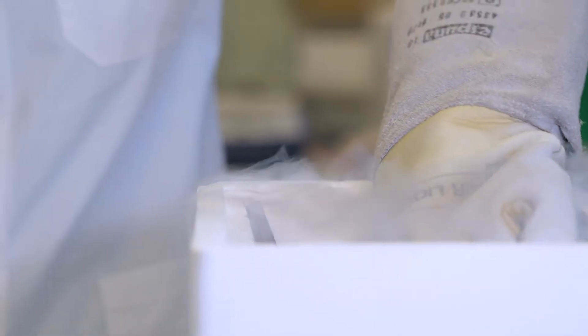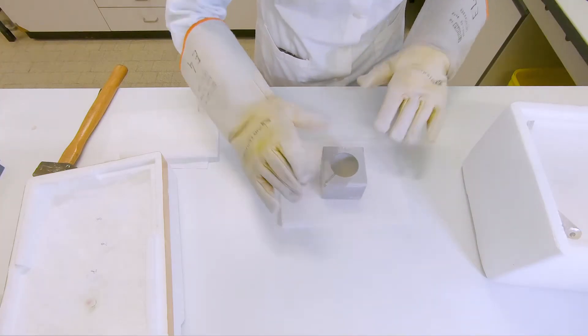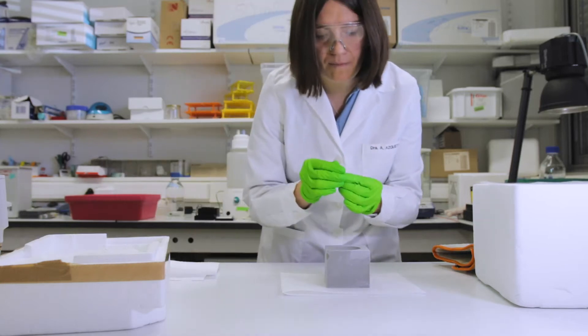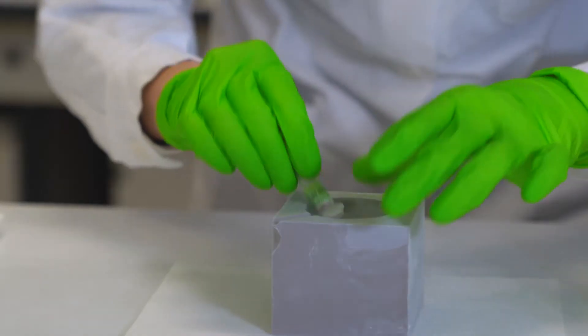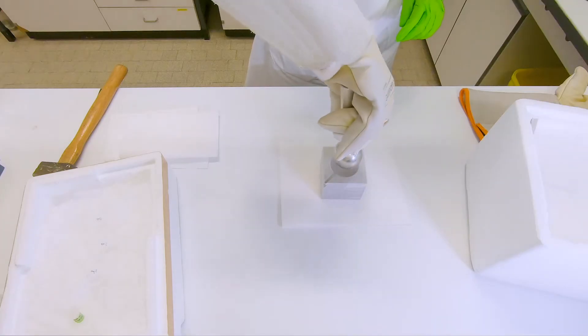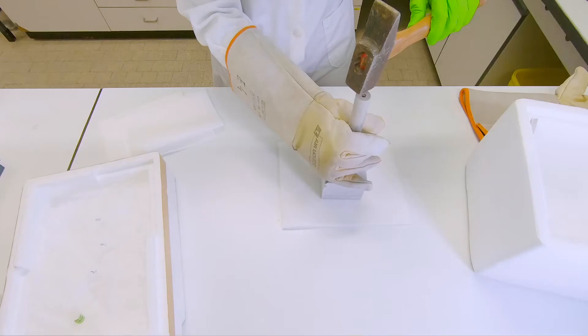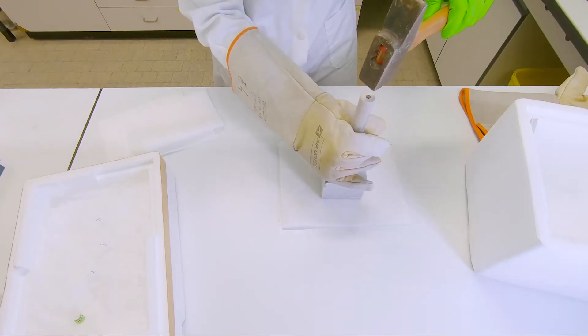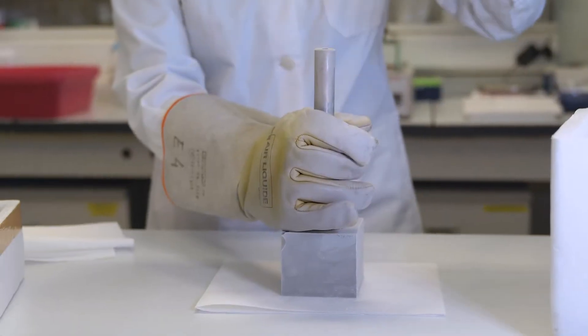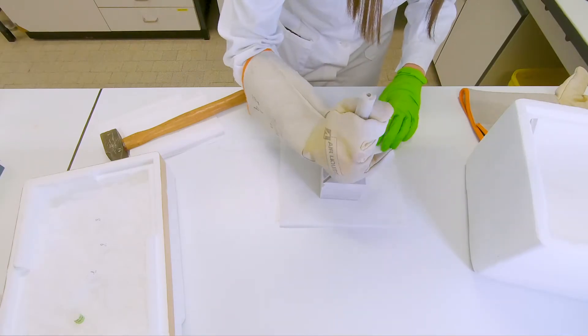So after the liquid nitrogen stops bubbling, you take out the mortar. So first the cup. You put the frozen tissue inside, and then you take out the pestle. So with a hammer, we will smash once, twice, and then you can use the pestle to grind the tissue some more.